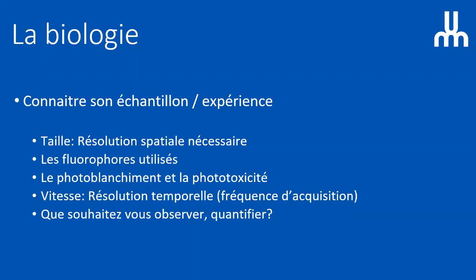So for example, the size and the resolution that you need. Do I want to see a full cell or do I want to see a mitochondria? This is a question you need to answer before doing your experiment. You also need to know what fluorophore you should use or what fluorophore you are using. It is very important to check that the fluorophores match the filters, for example. You have to be aware of photobleaching and phototoxicity, two important things that I put on the blog of the wiki.